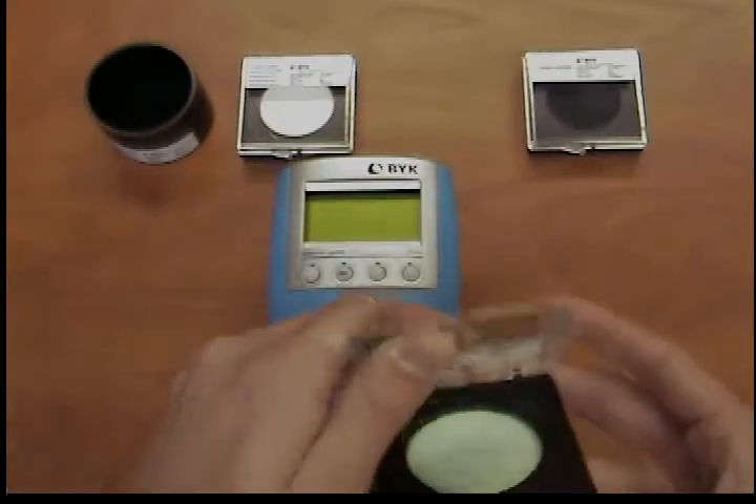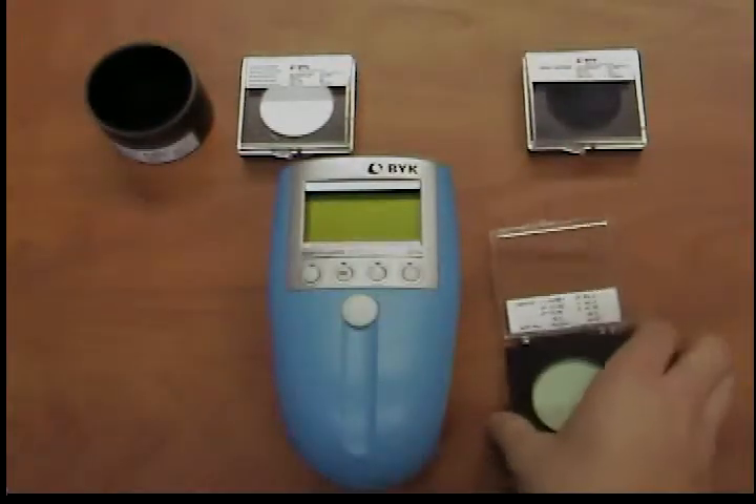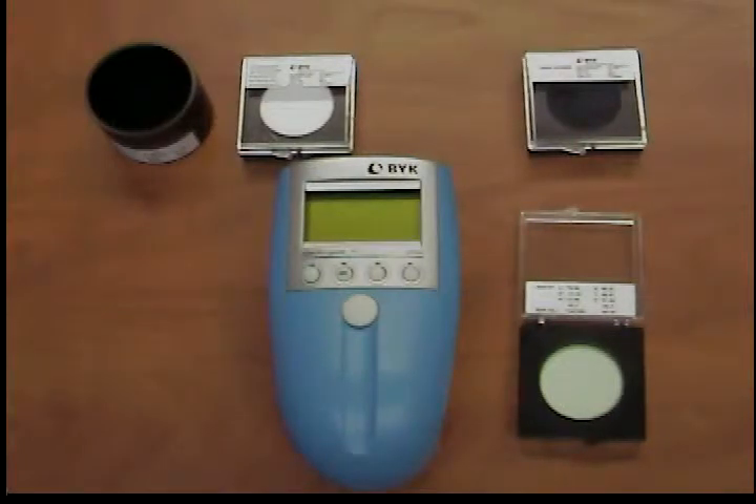The measurement results are very stable over time. With proper handling, it is possible to obtain calibration intervals of up to three months.